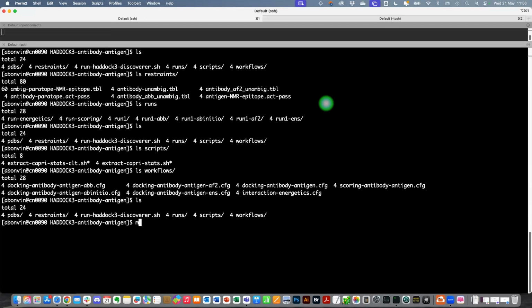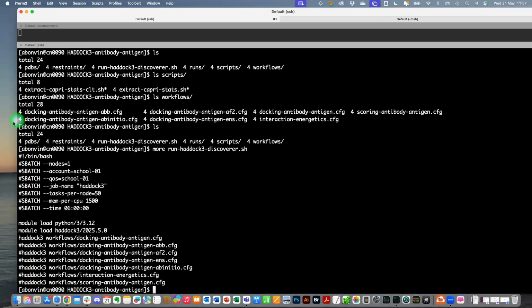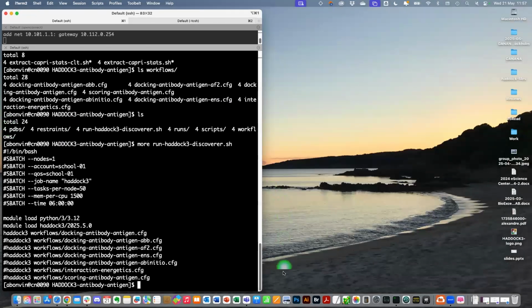And then, so this is the script. Oops, sorry. I'll go away.